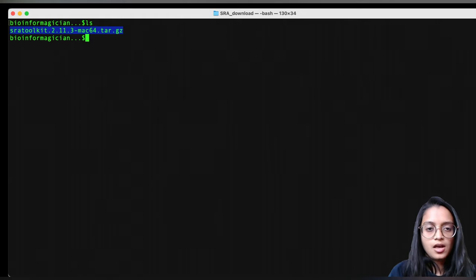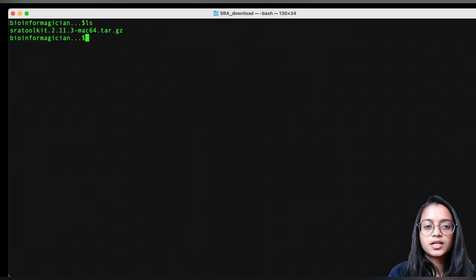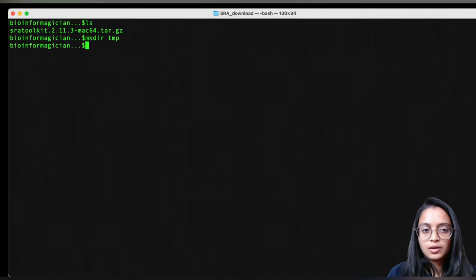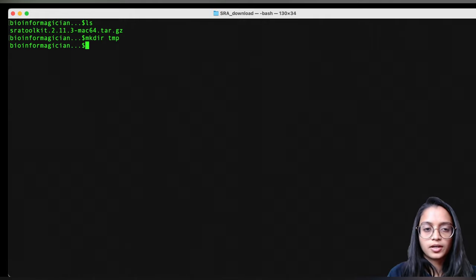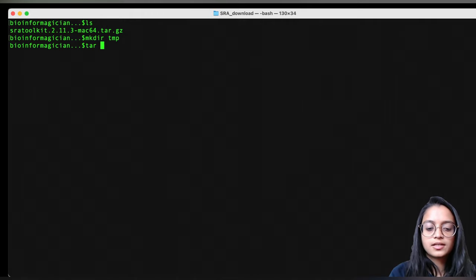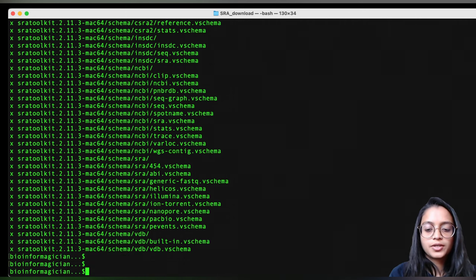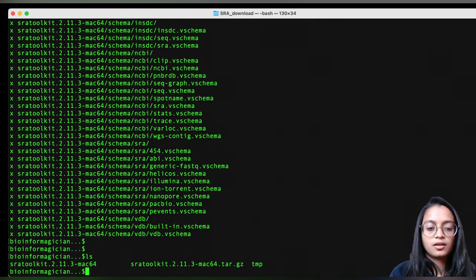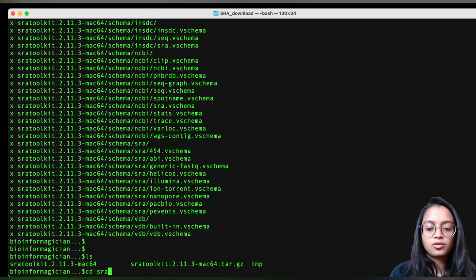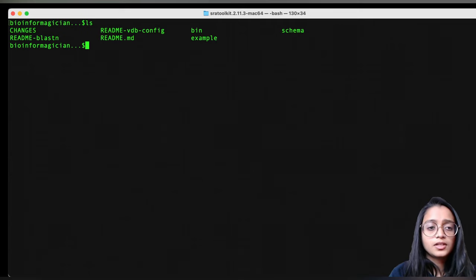I've finished downloading the SRA Toolkit, and it gets downloaded as a .tar.gz compressed file. Before I uncompress it, I quickly want to create an empty directory in my working directory — this will make sense why once we configure the SRA Toolkit. Let's uncompress the SRA Toolkit file now. It seems it has finished uncompressing. We can see another folder with the same name has been created, and inside it there are multiple files and folders.